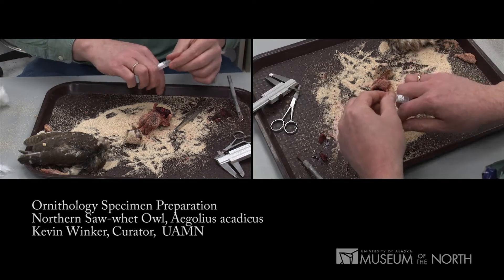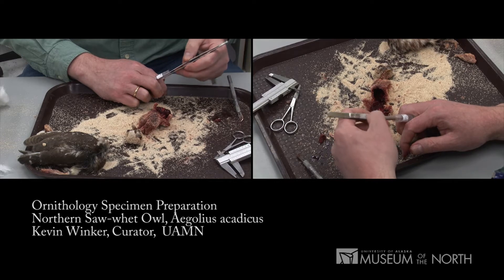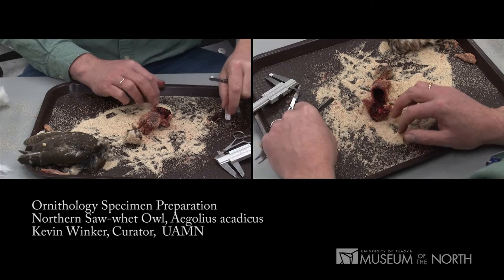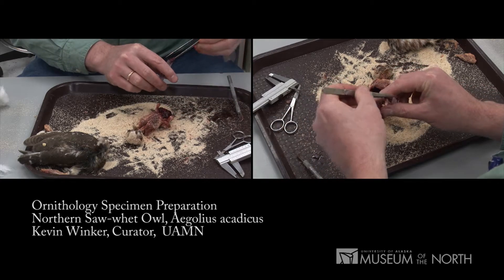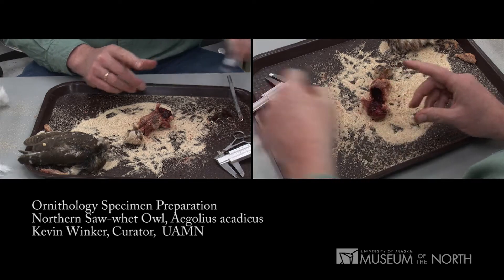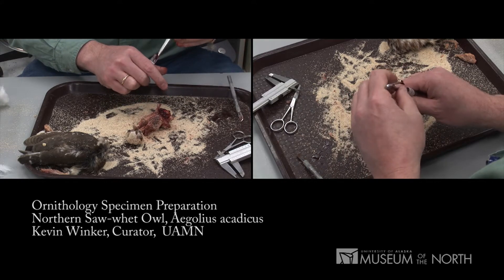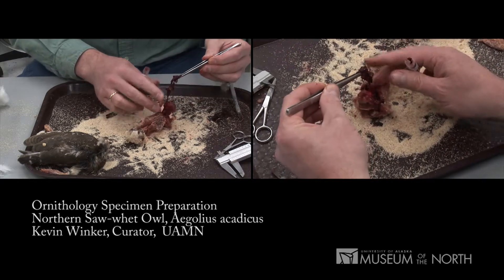We put them in these small cryovials — vials that can withstand very cold temperatures. There's half the heart in one vial, half the heart in the other vial. I'll put some liver into that. This gives us several different protein types as well as the genetics of the animal. They still have ice crystals in them, so we're keeping our tissues at very high quality by attending to them quickly during the preparation process.